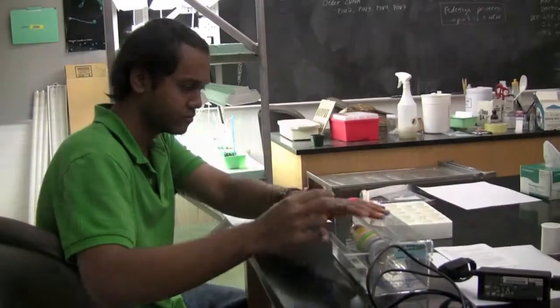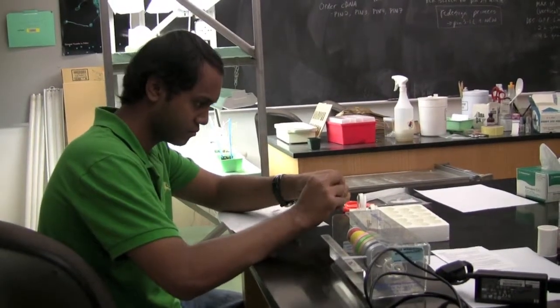This summer we're working in the lab. My lab studies plant responses to environmental stimuli like light, touch, and gravity. This summer we're focused mainly on gravity responses.